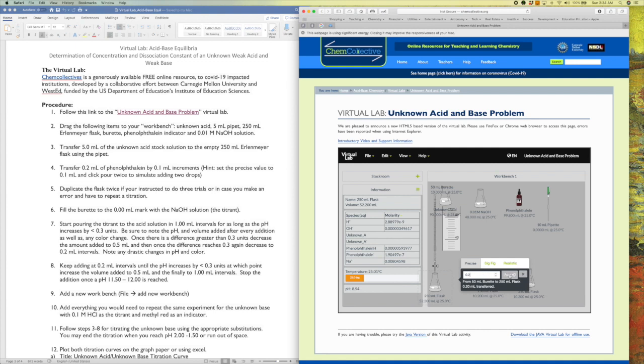I'm going to keep going, right? Noting also the color of the flask. So notice now this flask, and if you didn't notice, you should maybe rewind the video to see the difference. It has now become pink, right? It is definitely pinker than our stock solution, right?